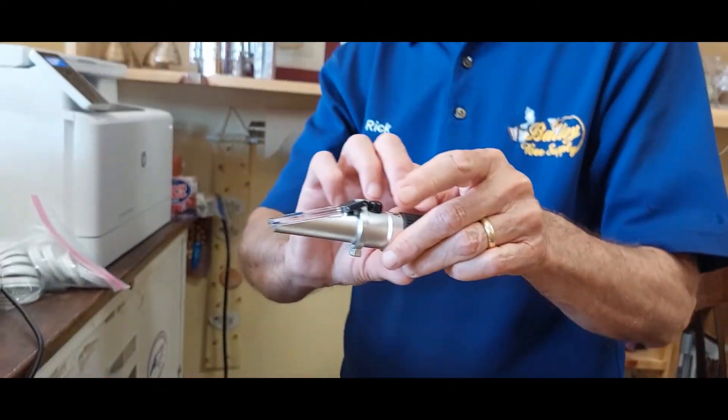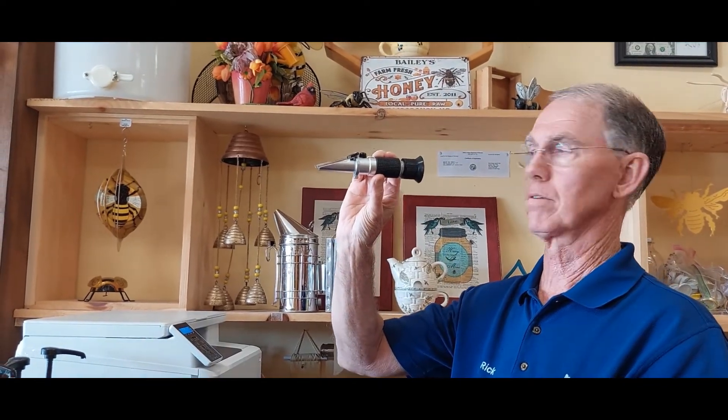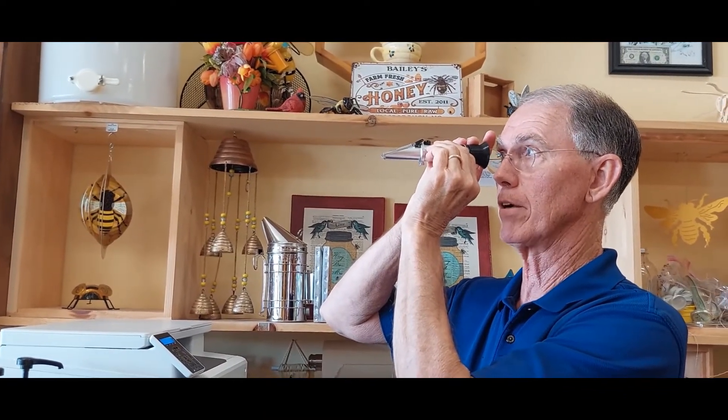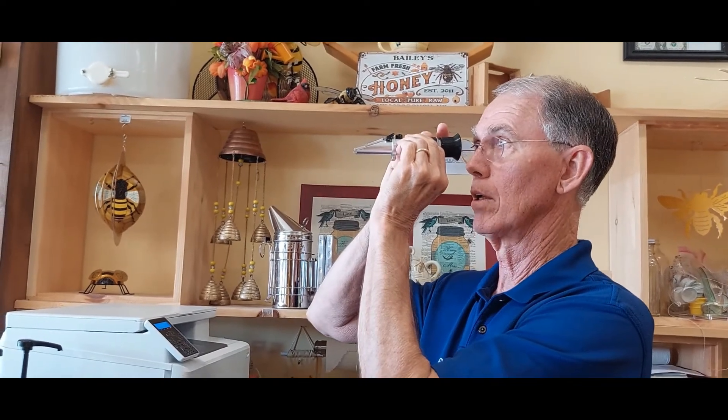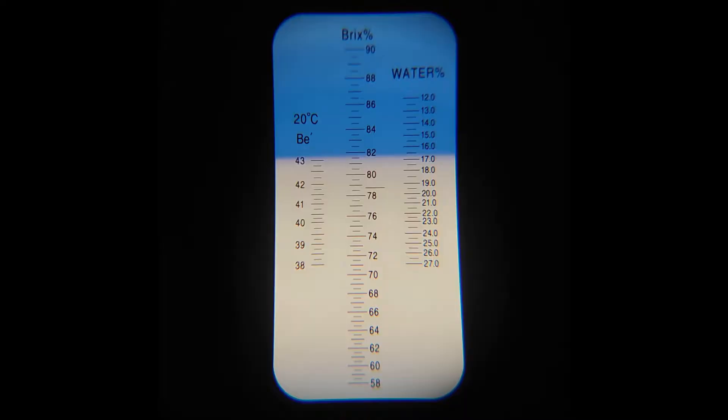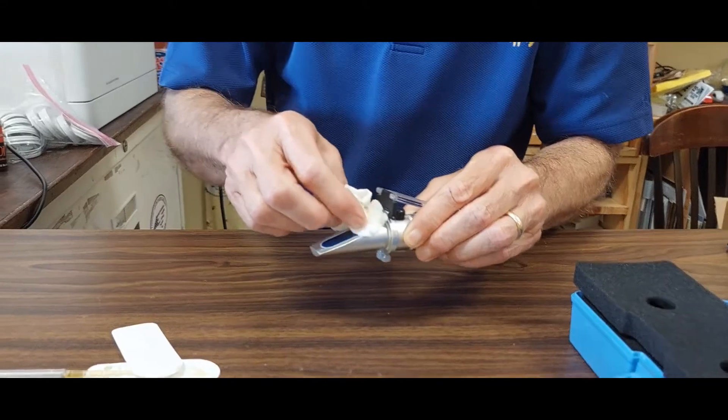So we're ready to read the sample so you hold it up you point at a strong light source you can go outside and that probably works the best for you but we can shine it right at this window and hold it up to your eye just like you did with the calibration fluid and you just, you may already be in focus from when you calibrated it but focus the eyepiece here and then you read your sample and this one is less than 17 so that's a good honey sample.